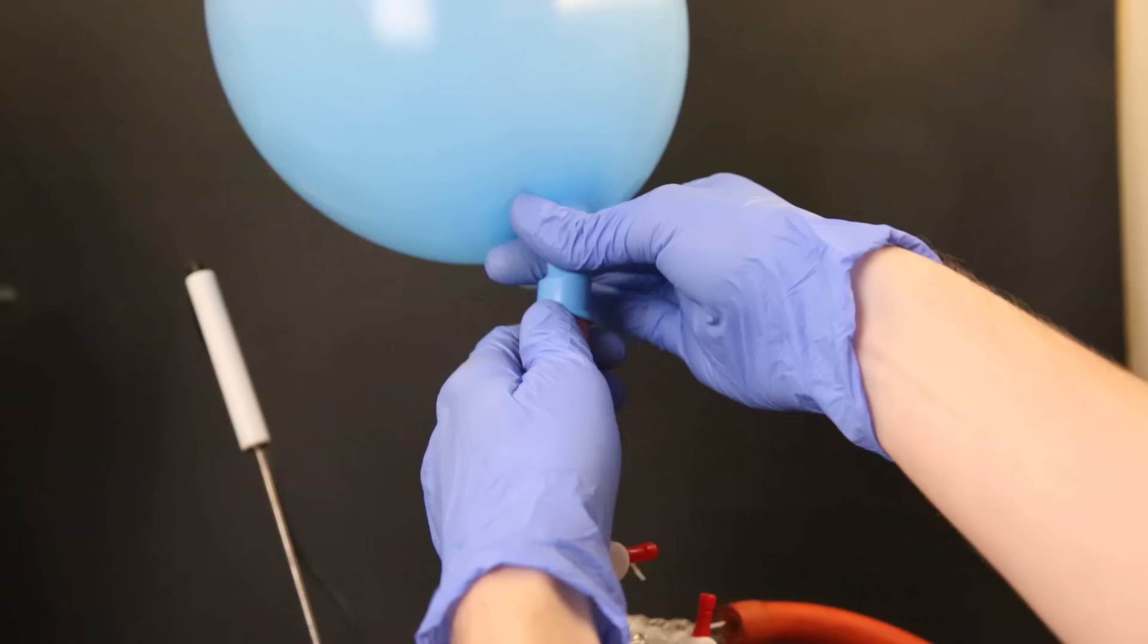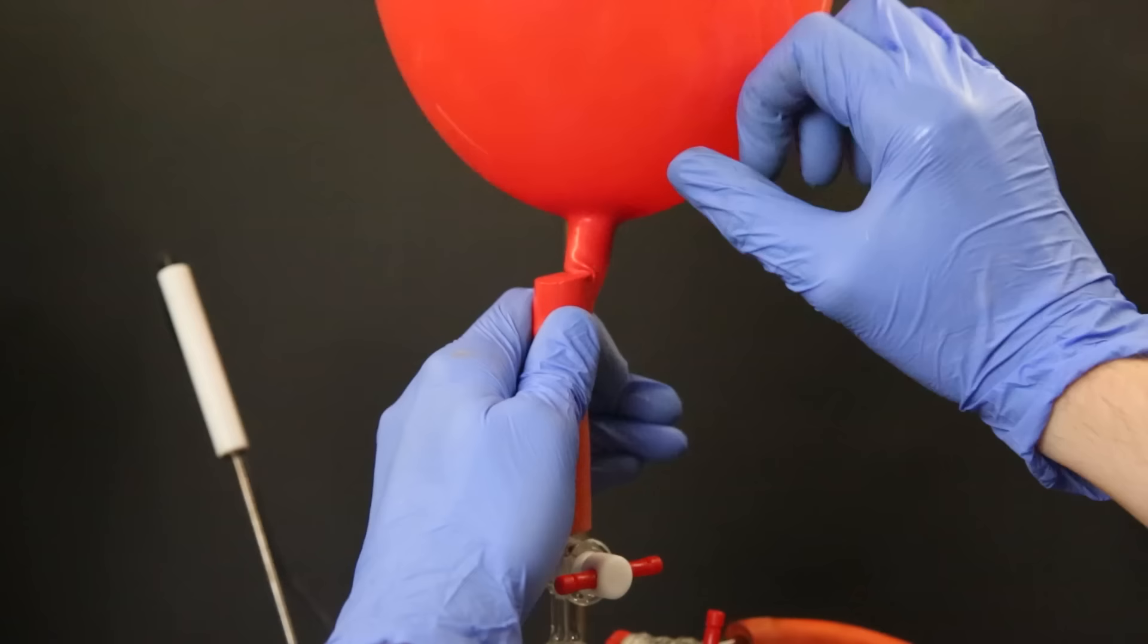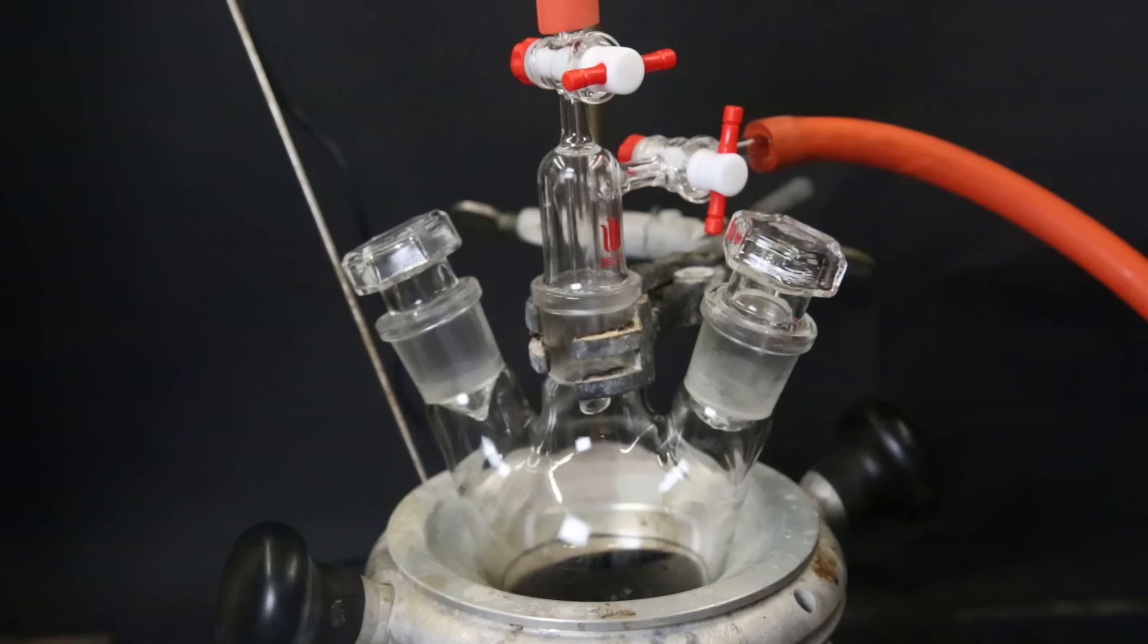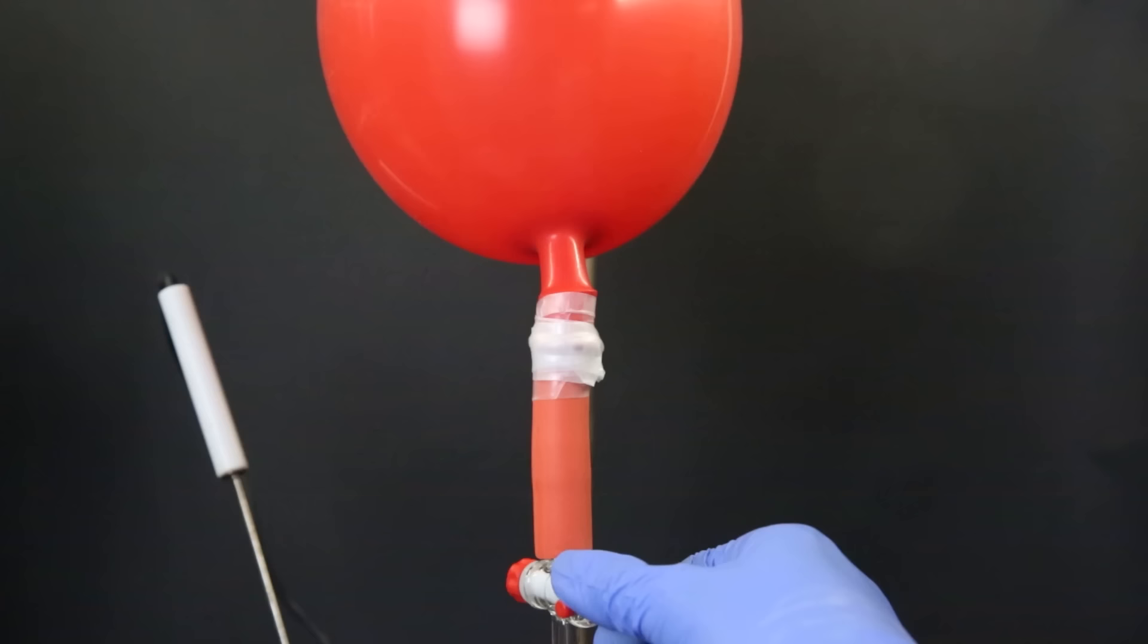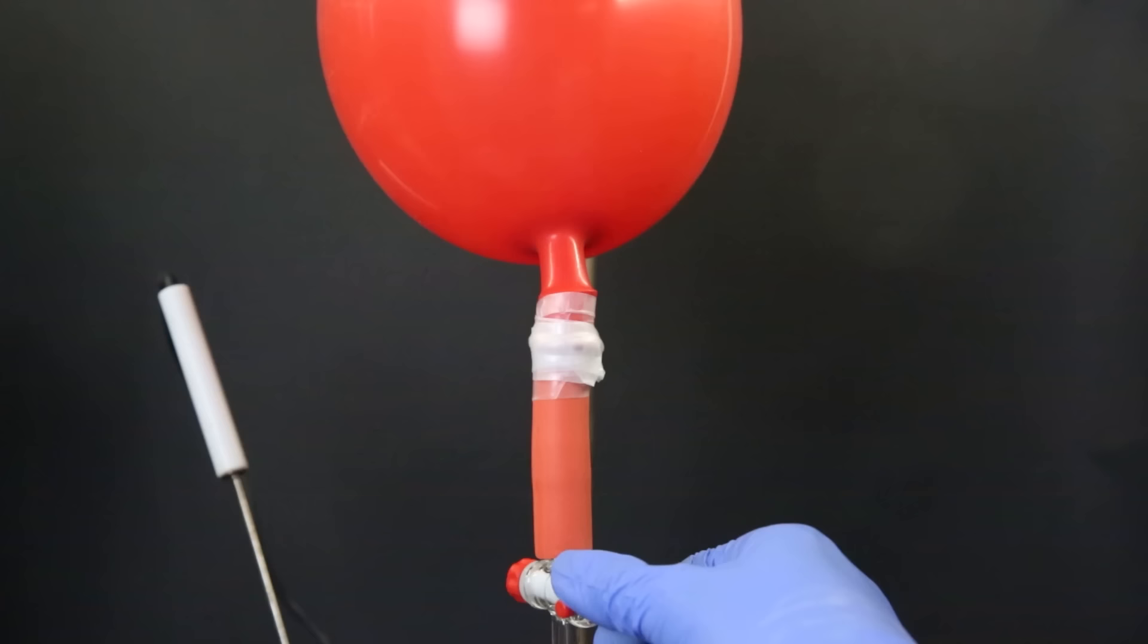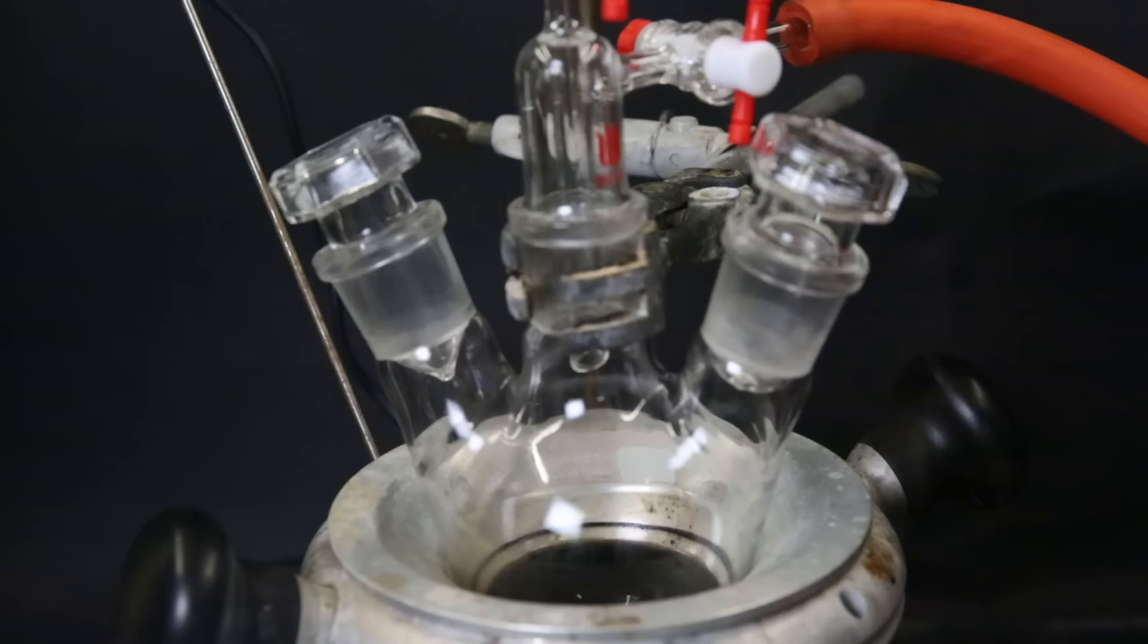I remove the argon balloon and then attach a new balloon filled with hydrogen. In the same manner as before, I now want to replace all of the argon with hydrogen. So I repeat the same process as before. When that is done, I keep the way to the hydrogen balloon open so that the reaction can also consume hydrogen directly from the balloon. Since the amount is quite little, one balloon contains more than enough hydrogen to complete the reaction.